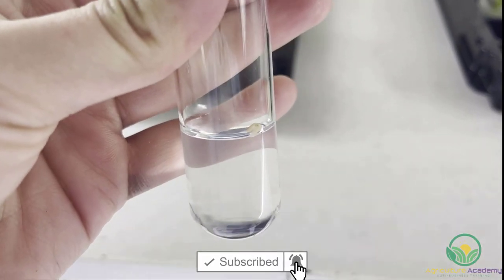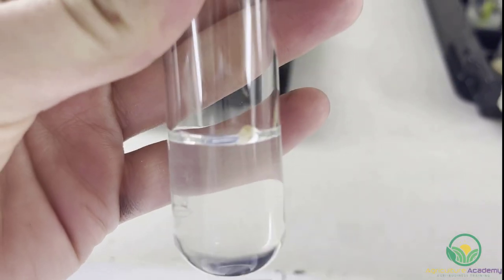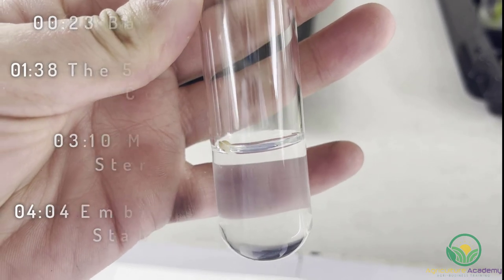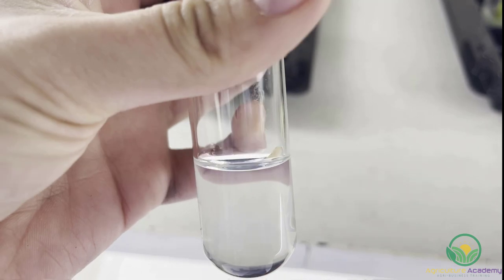Tissue culture is a method of micropropagating plants in an aseptic or sterile manner. In this video, we're going to take a look at the principles and practices thereof as we show you how protea seeds are germinated in tissue culture.